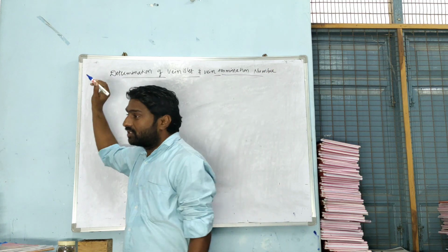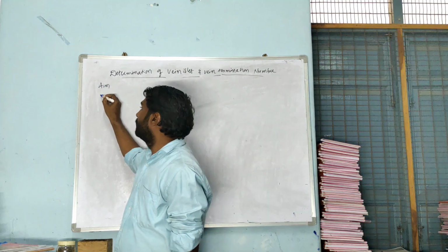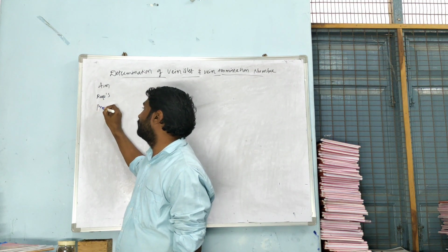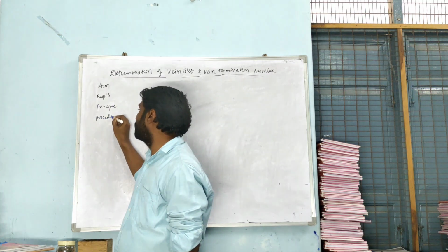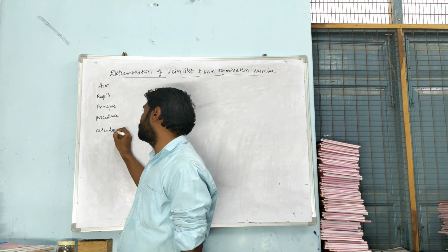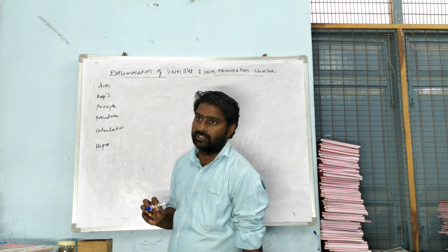So whenever we enter into a practical, right, so definitely we would have an aim. There are some requirements, then which will be followed by a principle that is involved. Then we go through the procedure. Then we would have a calculation part, and finally we would like to report what we found.